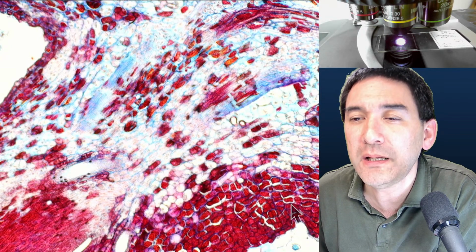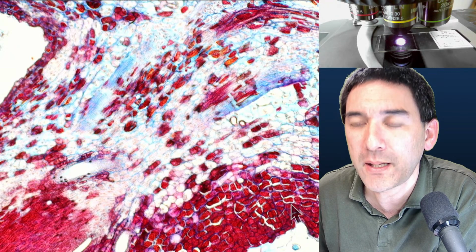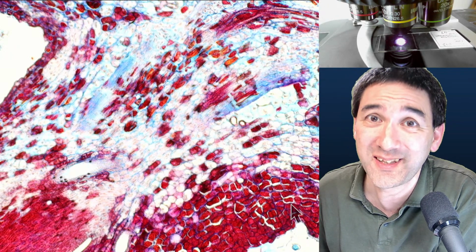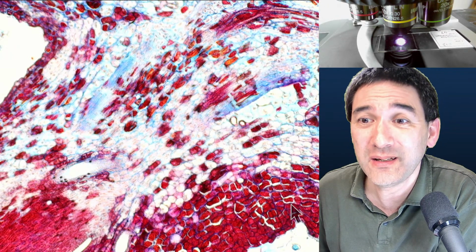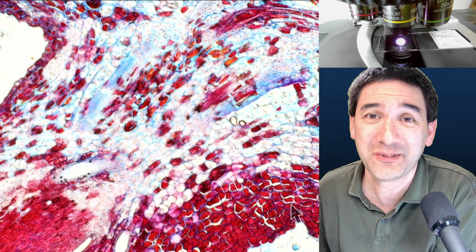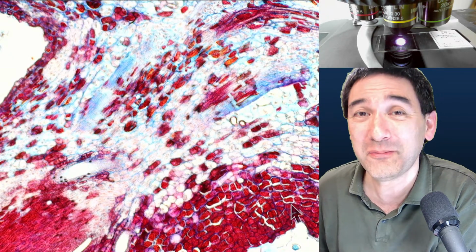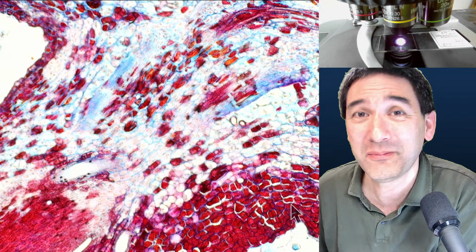Would I need a big microscope to see white blood cells? What is a big microscope? That is the thing. You can see white blood cells also at a relatively low magnification, but maybe not very well. So it's a question of how much magnification you want to have. Generally, even small microscopes will magnify, maximum total magnification is 1,000 times.